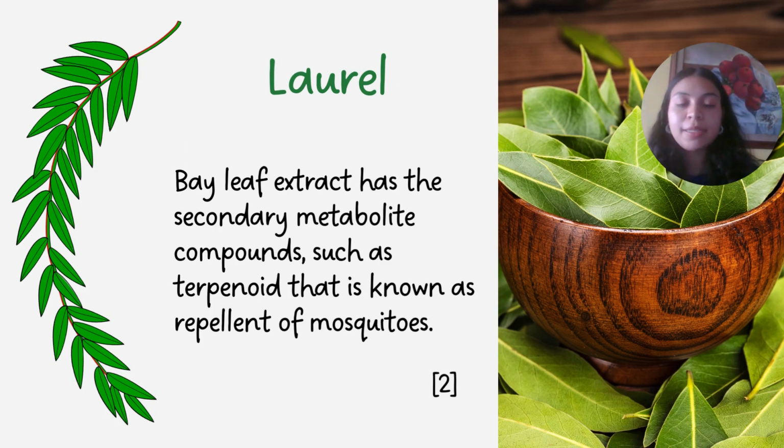For this lab practice, our group used bay leaves as a natural repellent, and bay leaves extract has secondary metabolic compounds such as terpenoid, known as a repellent for mosquitoes naturally. And we made this repellent from 2 cups of water and 10 grams of bay leaves.